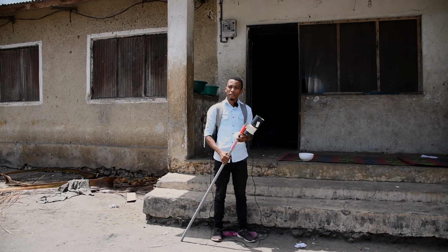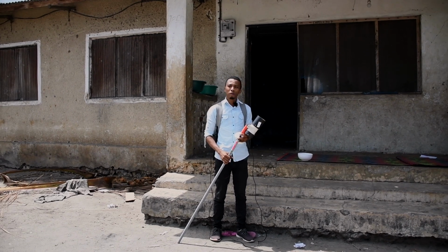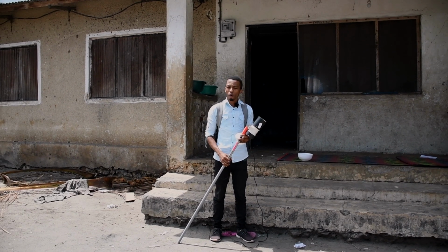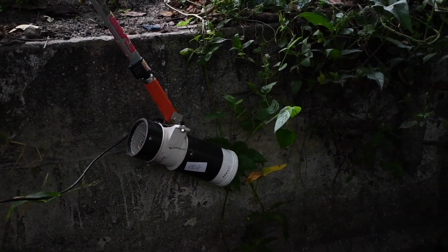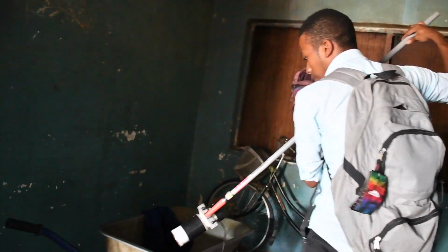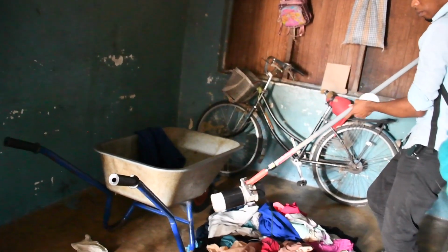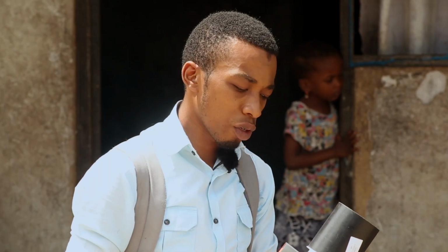This is the backpack aspirator, also known as the Procopack aspirator. The Procopack aspirator is used to collect mosquitoes in both indoors and outdoors environments. The Procopack aspirator can be used to collect adult Aedes mosquitoes in outdoors areas, but also adult Anopheles and Culex mosquitoes in indoors areas. The Procopack aspirator has a powerful motor that pulls the mosquito inside.